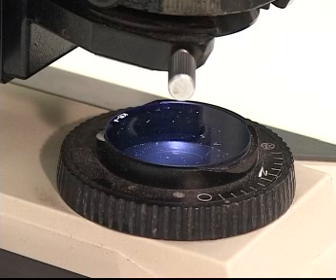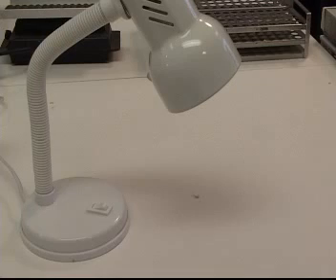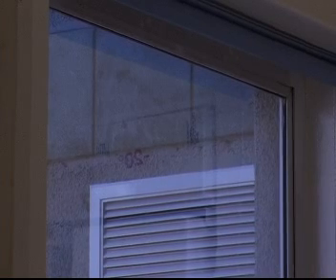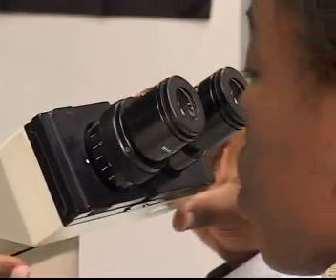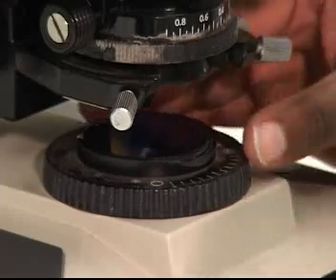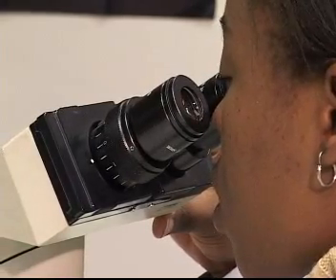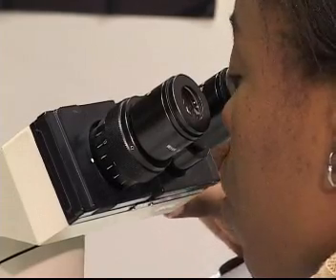If the microscope you are using does not have a built-in light, then switch on your table lamp, or you can place your microscope near a window. Now, look through the eyepiece and adjust the mirror until your field of vision is evenly illuminated. By this, I mean the area you are looking at must have enough light. Remember, once you have adjusted the light, you shouldn't move the microscope or the lamp. If you move them, you may need to readjust the light. You can use daylight by adjusting the mirror towards the window.